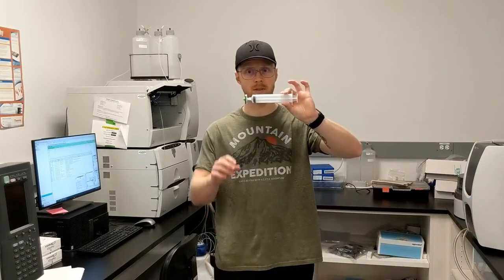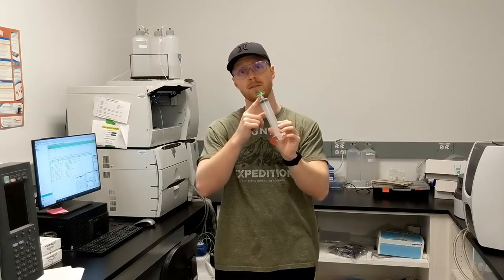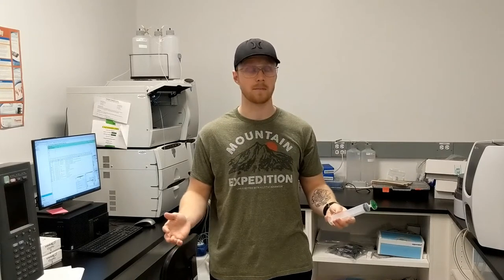One way that you can filter is with syringe filters — it needs to be at least 0.45 micron, though it can be smaller like 0.2. Sometimes you can vacuum filter and sometimes you can centrifuge, but talk to the people who manage your IC to make sure that that's okay first.